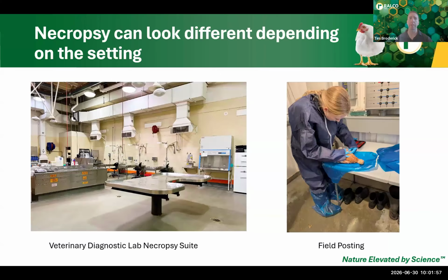So we want to stress first that necropsies can look different depending on the setting. There's the clean, pristine environment of a veterinary diagnostic lab suite where we're looking a lot more at histopathology, taking different samples, doing microbiological analysis, all to complement the actual gross pathology and necropsy.